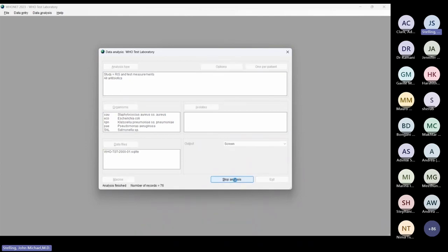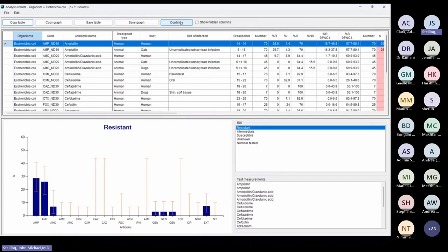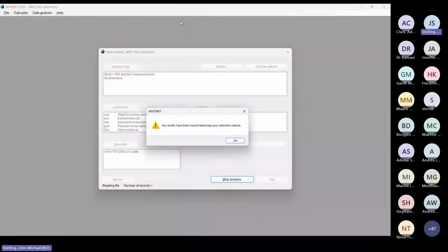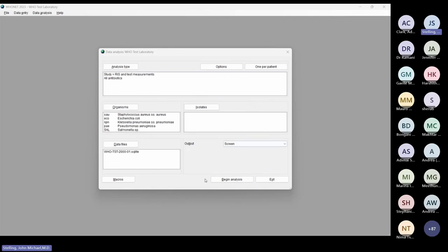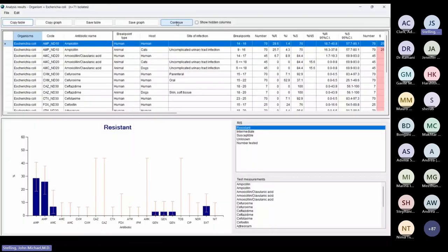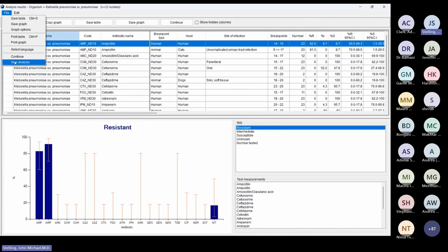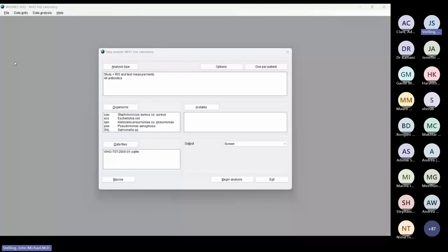You can stop an analysis at any time by clicking File in the upper left menu and selecting Stop Analysis — you don't have to click Continue through every organism to reach the end. Going to the Stop Analysis option stops the analysis immediately. I'll now go back to the PowerPoint.